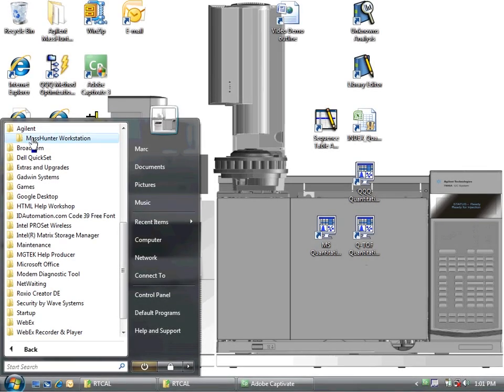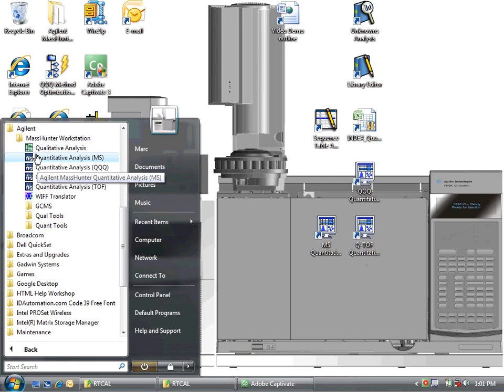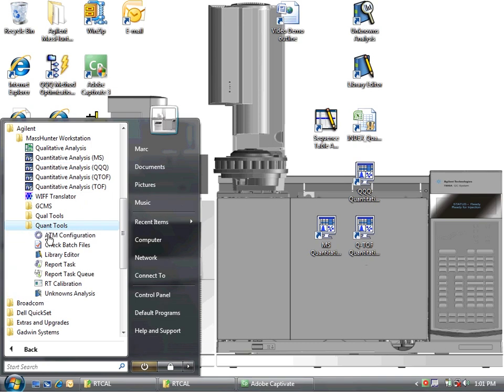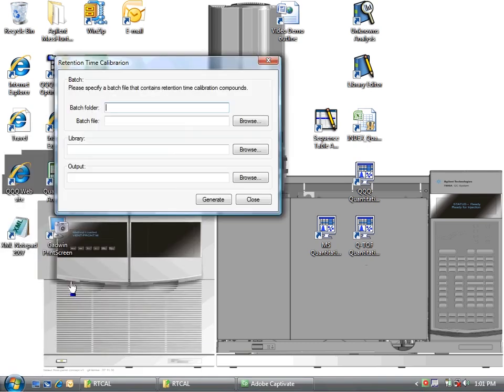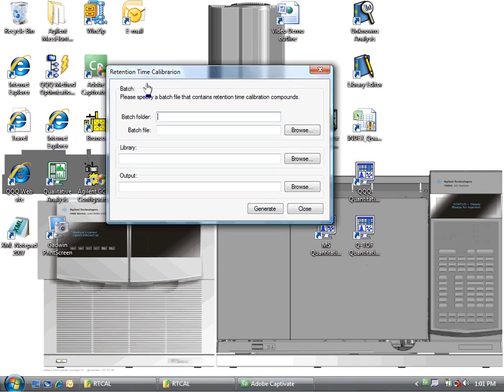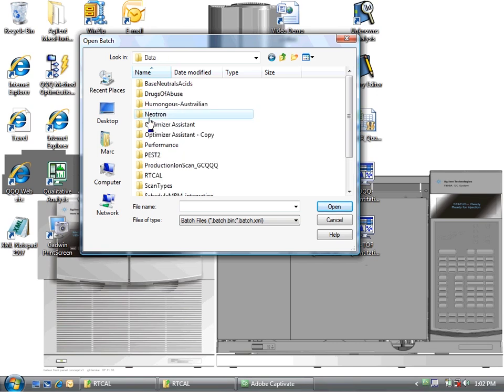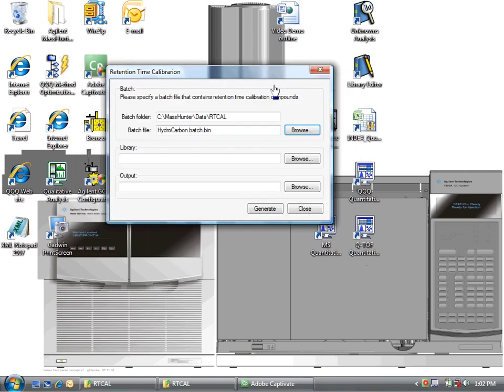Alright, let's start up the retention time calibration tool. I need to go to the start menu or look for the icon. Let's go from the start menu, and I'm under here Quant Tools, and I will see RT Calibration. I will start that up. So the parts that I need to define are first the batch. So I need to find that batch that I was just working with, and that is under RT Cal. The batch I created was hydrocarbon.batch.